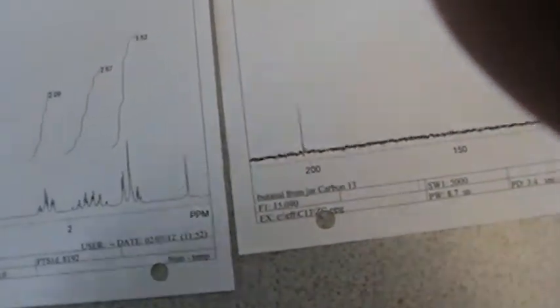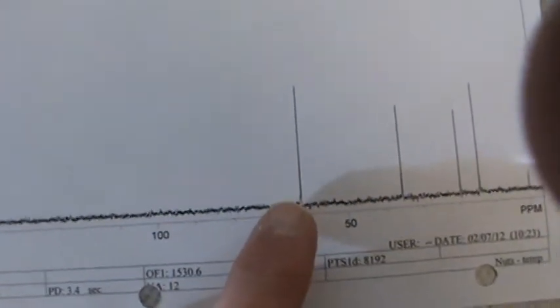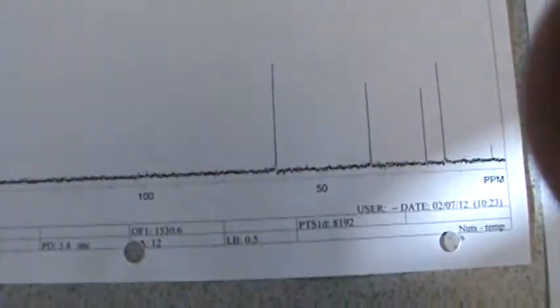So let's go ahead and look at the carbons real quick. Here is the butanol, and as you'd expect, there should be four carbon signals. Flat baseline, nothing, nothing, nothing. Obviously, the signal that's furthest left has to be the carbon next to the alcohol, and then the next one, and the next one, and the next. So there's only 4. I'm pretty sure you can find this on that Japanese SDBS site. I'm pretty sure it's already assigned for you.